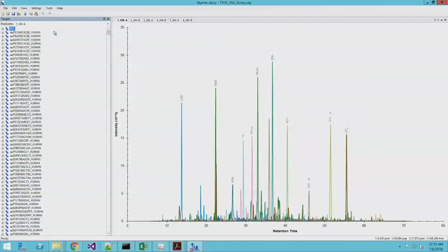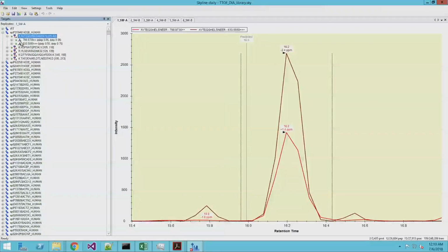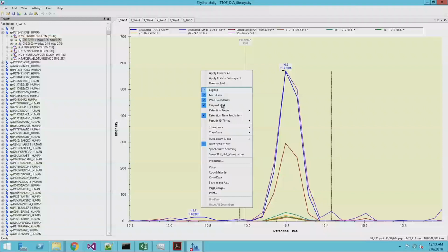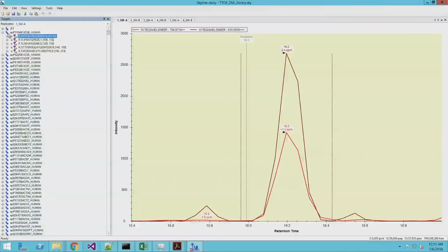Okay. Well, I don't really have a lot more prepared. I would definitely be looking at this data a little bit more. I haven't looked at it enough myself. I've shown you some of the things that I've started to see, but haven't looked at it enough myself to have a whole lot more to say. But I think hopefully you go home with some decent tools with Skyline for visualization, running at the command line, doing parameter analysis, and all that.